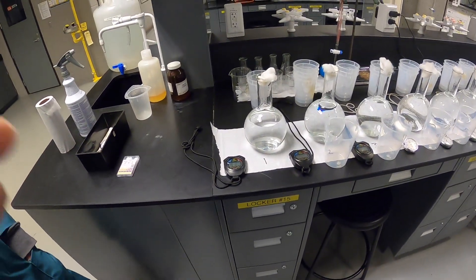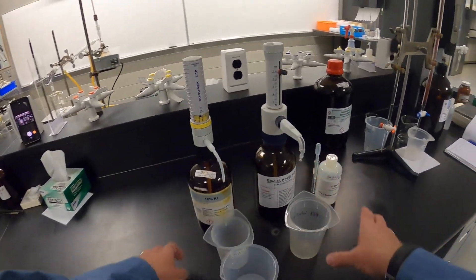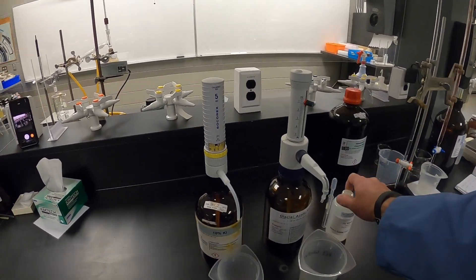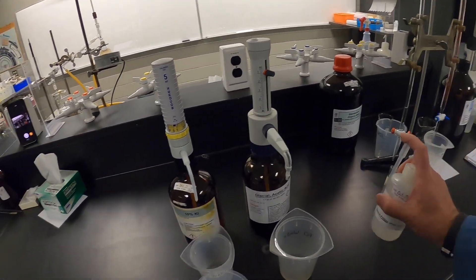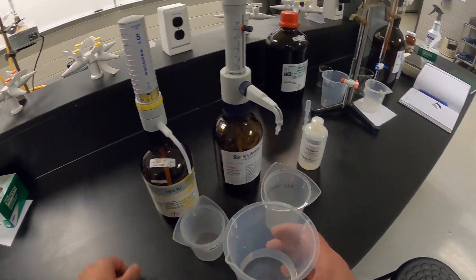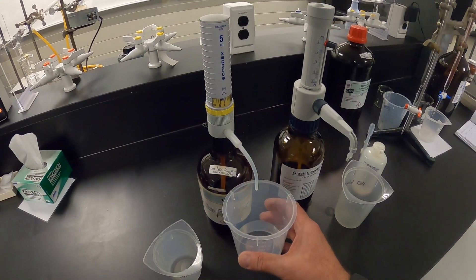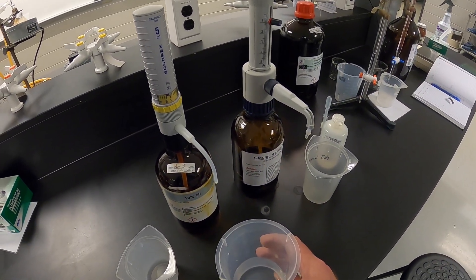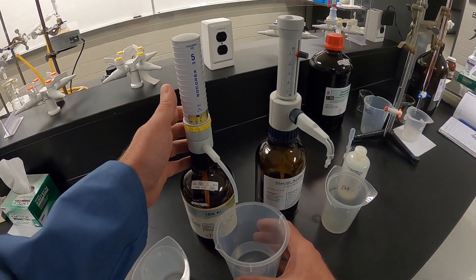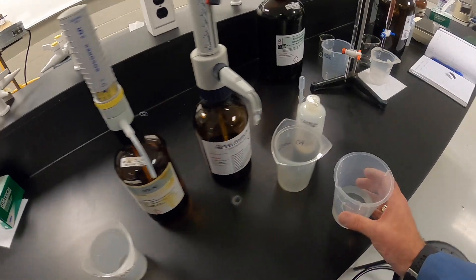These have already been primed: it's one milliliter of potassium iodide, one milliliter of glacial acetic acid, and about two milliliters of the starch solution. That's exactly 30 minutes. Ian adds the starch.